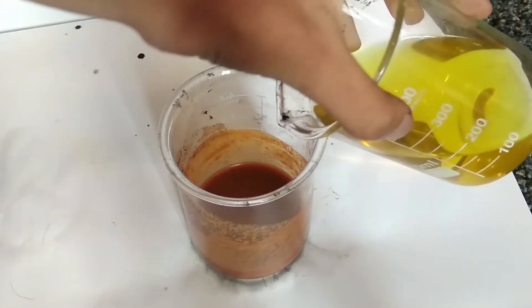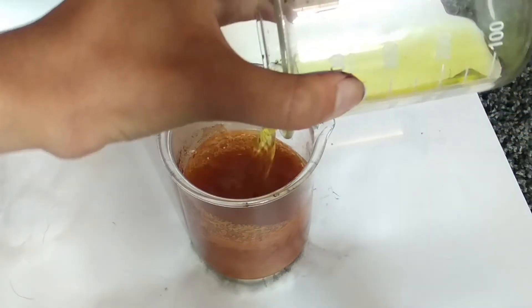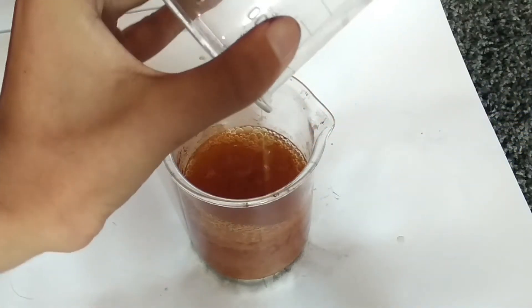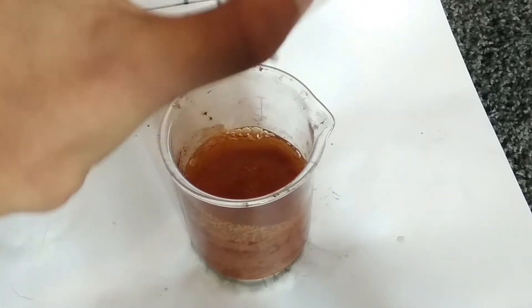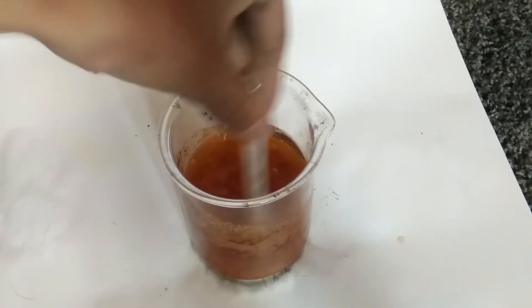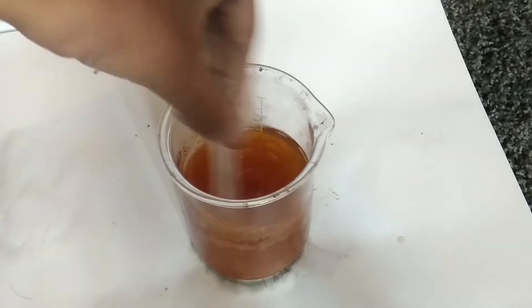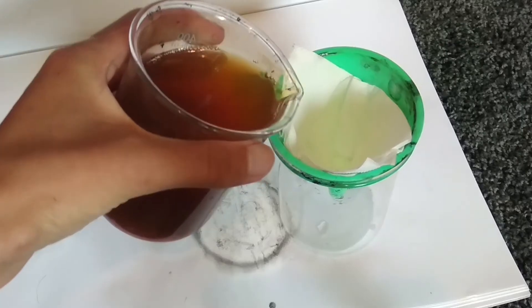After filtering this and washing out excess hydroxide, we're going to add this gross mixture back into the yellow solution. Now we just leave them together overnight. This allows oxidation to take place so the manganese hydroxide will be converted into soluble manganese chloride, and the iron 3 chloride will be turned into insoluble iron 3 hydroxide.